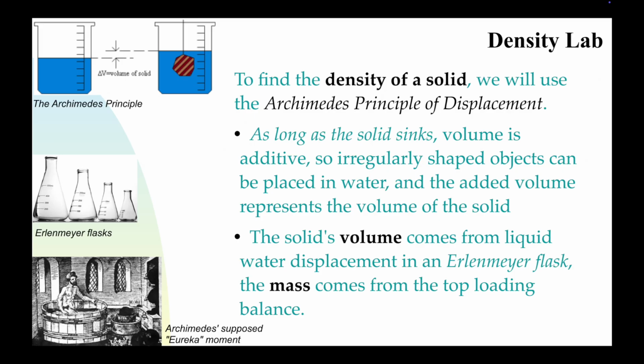The mass of the solid, you could use that mass balance once again. So that's not too hard. The volume is the more tricky one. By the way, there are people that aren't sure if there was really this eureka moment in Archimedes' life. It was apparently told by many people. I like to believe it's true, but who honestly knows if it is or not. But it's a cool story either way.